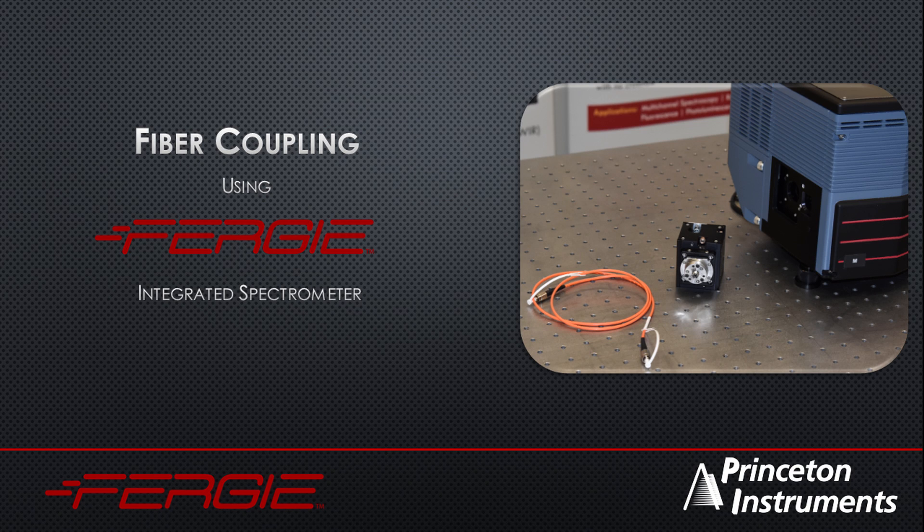In this video we are going to demonstrate several ways to connect optical fibers and fiber-connected probes to the Fergie spectrograph.